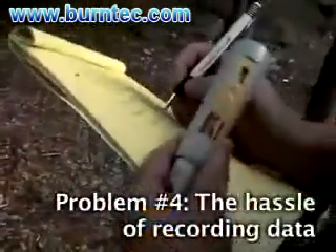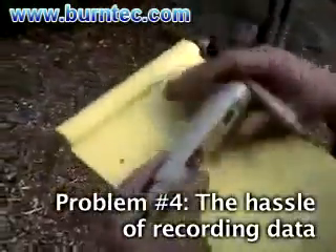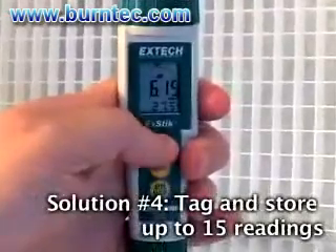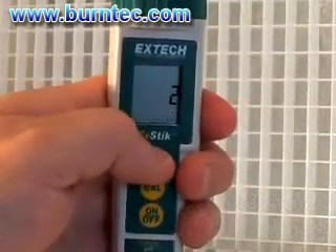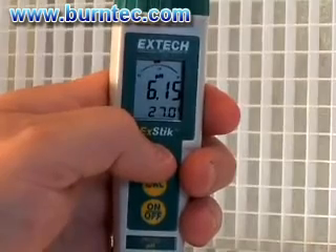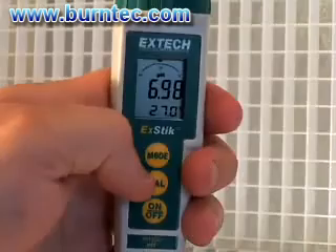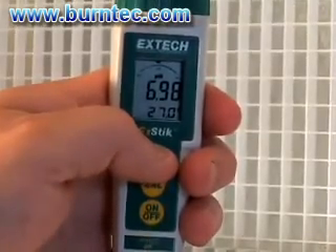Problem number four: recording data on paper can sometimes be difficult when you are taking measurements out in the field, especially during times of unpredictable weather conditions. Solution: the built-in memory featured on the ExDIC pH meter will record up to 15 measurements. Each stored reading will be labeled by a number for easy recall. This feature eliminates the need to bring samples back to the lab. It not only saves time but provides maximum accuracy for on-the-spot data recording.